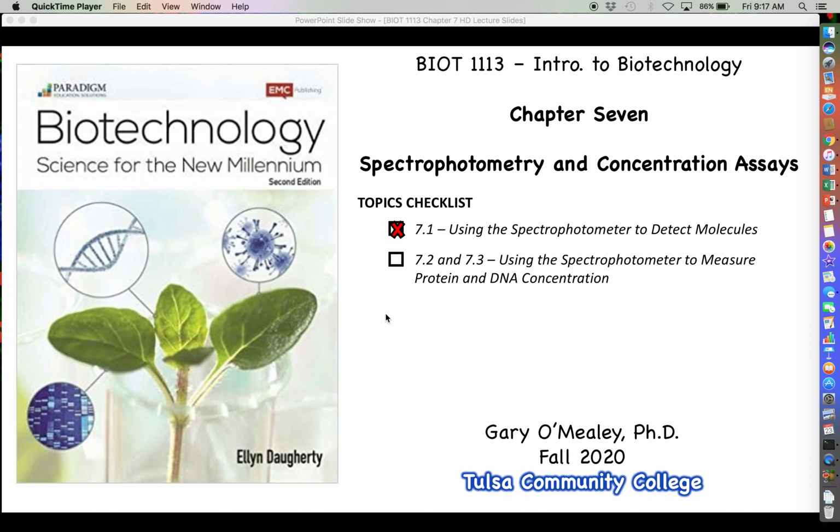Hello and welcome back for one more video in Chapter 7 in which we are looking at the theory and practical usages behind spectrophotometry and concentration assays. So in the previous video we really got into discussing some of the general basics, the theory behind how spectrophotometry works, and some practical applications. In this video, we want to focus specifically on using the spectrophotometer to measure both protein and DNA concentration.